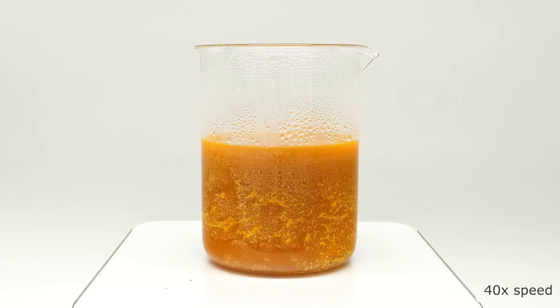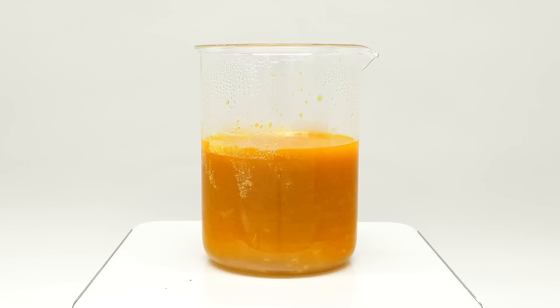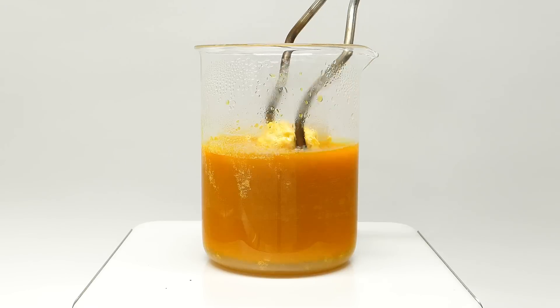For a while it kind of just looked like a mess, but then it started clumping up into a chunk that was rolling around the beaker. Over the next 20 minutes, it slowly got bigger and bigger, and when I felt that it was done, I turned off the stirring. What I had to do next was pull it out, and I was really hoping to see a nice ball.